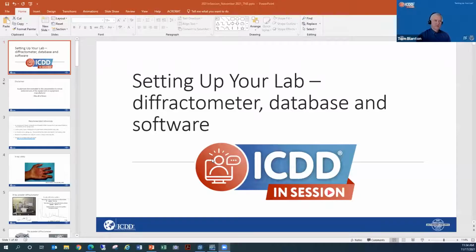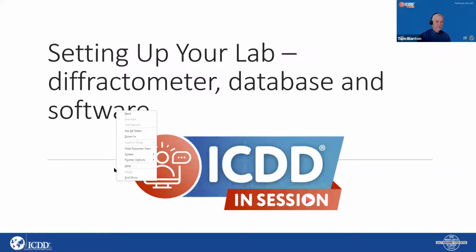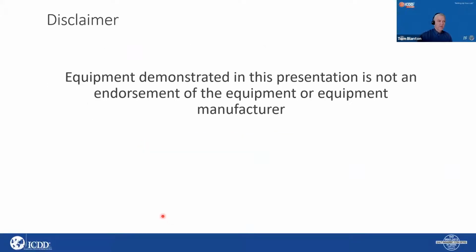Okay, so to follow up here, we'll start talking about setting up your lab in terms of some concepts around the diffractometer, the database, and software. I'm going to be showing some examples of equipment, and the equipment that's demonstrated is not an endorsement of the equipment or the manufacturer. I like all of them, and they serve the purpose of demonstration for our presentation today.